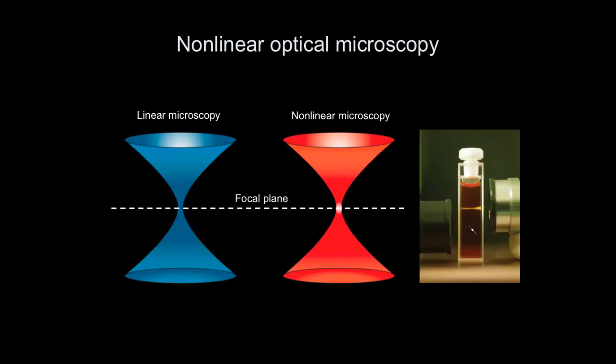And this is an image you probably have seen many times, and I'm almost embarrassed to show you. But you see here this excitation cone. In linear microscopy, you get signal from the entire cone, and in nonlinear optical microscopy, that's from this side here, only this little tiny spot. So after and before the focal plane, you get nothing. Nothing really contributes. There's no optical communication with the material. There's no excitation taking place, only right there. That's where the excitation is taking place. That's where the signal comes from. That's where the photodamaging takes place as well.